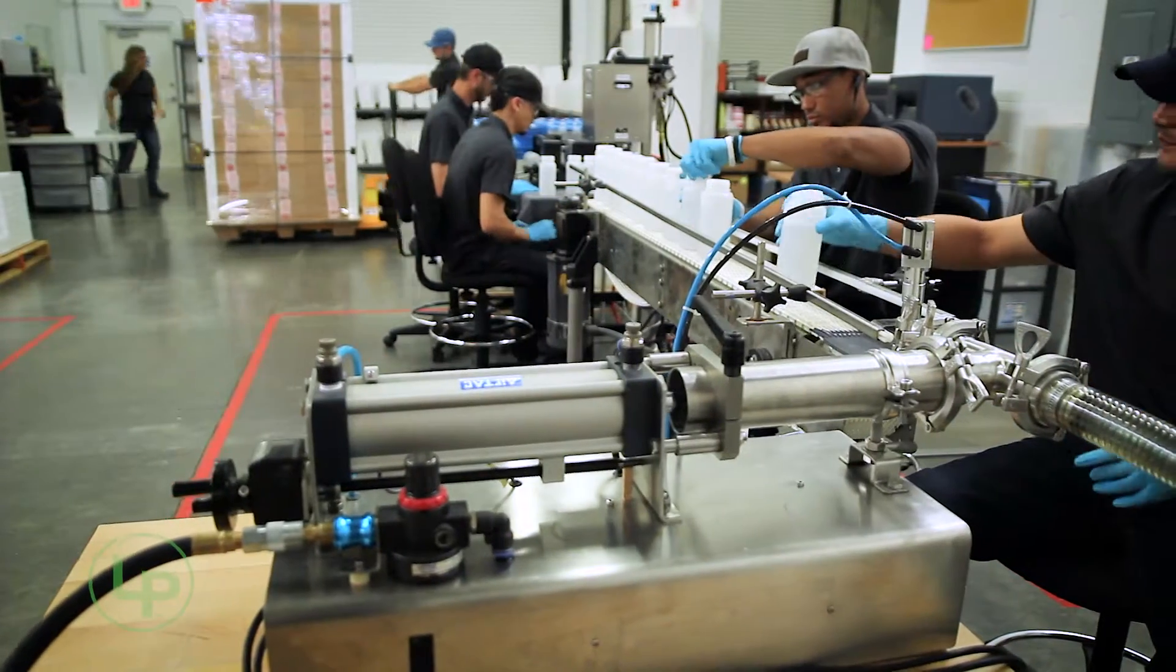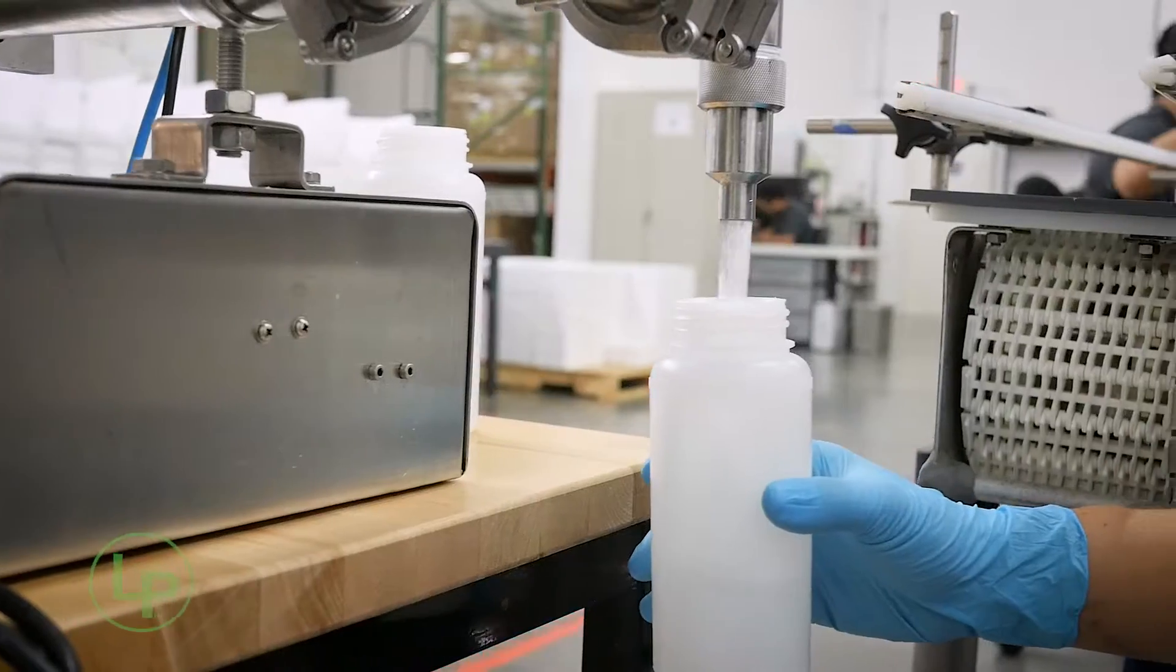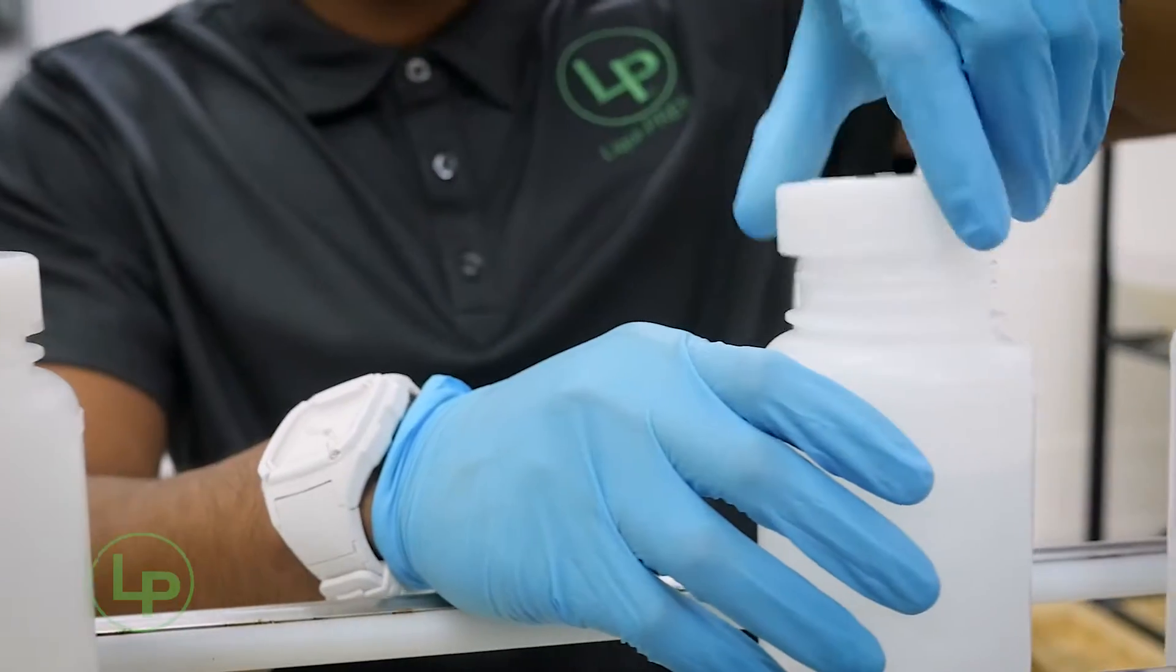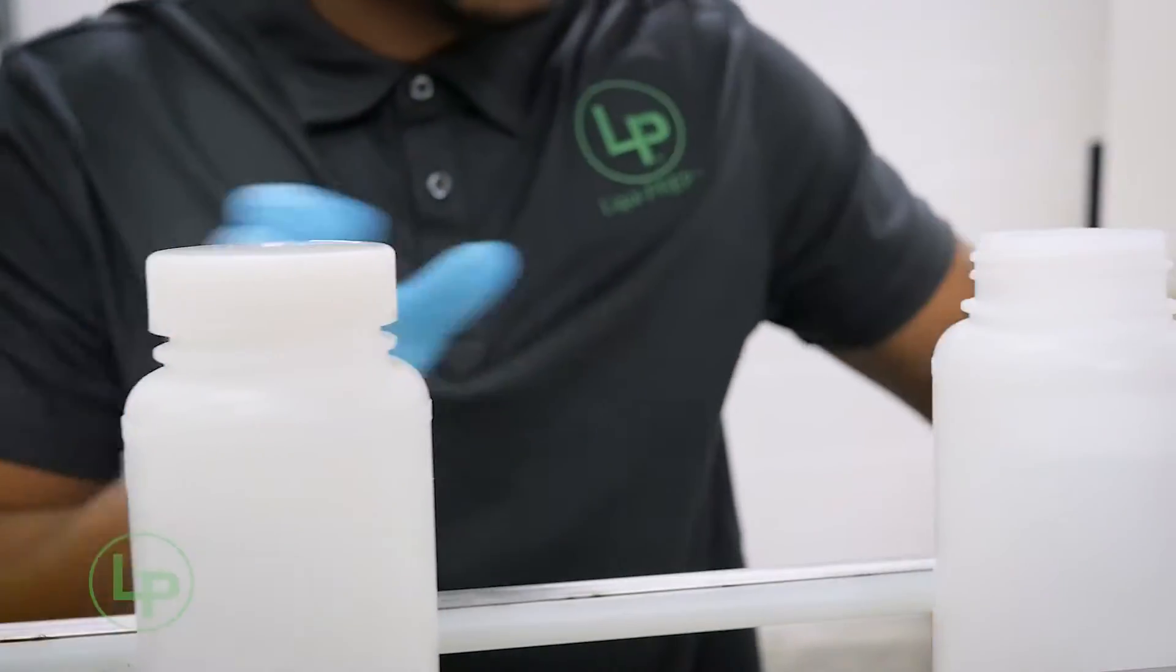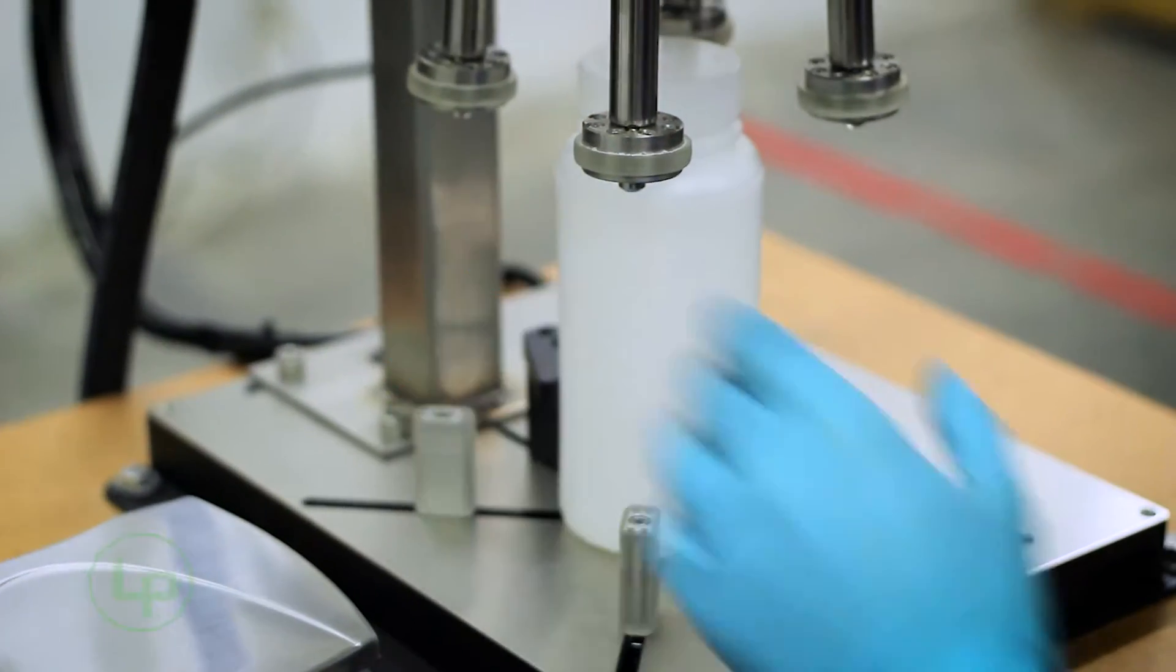LiquiPrep reagents used for various applications come in a variety of containers. All LiquiPrep reagents are manufactured under ISO 13485.